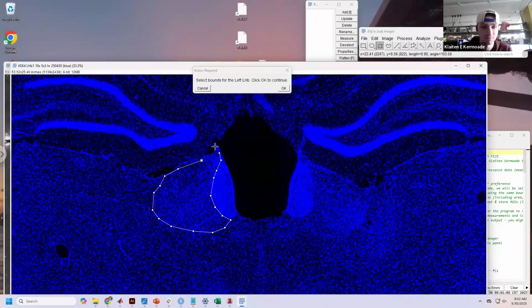If there's this little lip up here, try to get the lip in it, and then you'll either right click or double click to end the entry. So this isn't as good as I want. I want you guys to try to be as precise as possible. A lot of times it's hard to see this lower ledge, so sometimes you're going to need to make a judgment call, and that's perfectly fine.